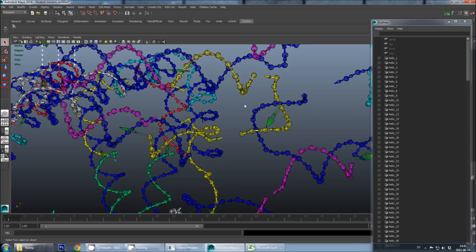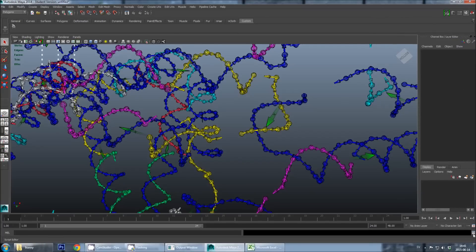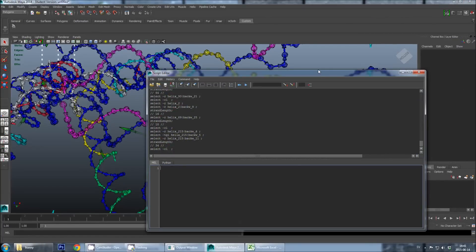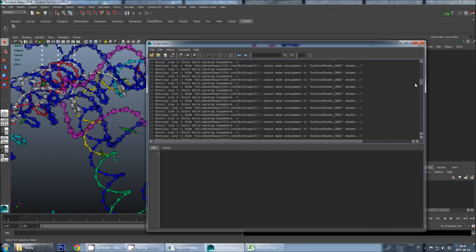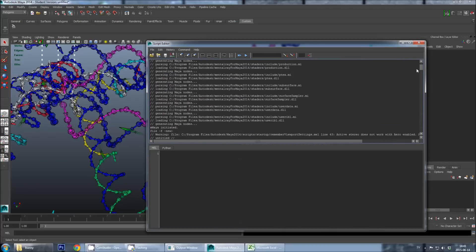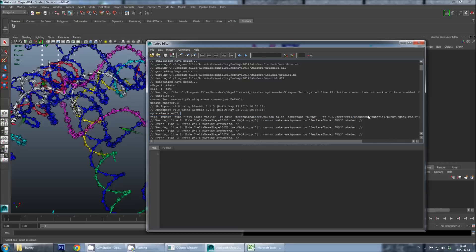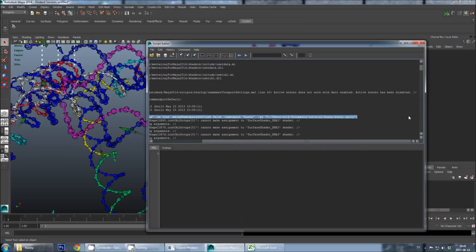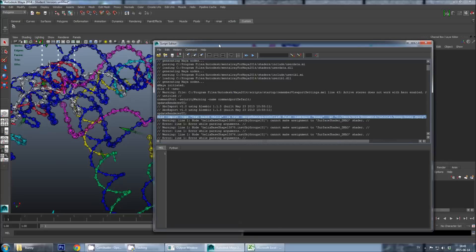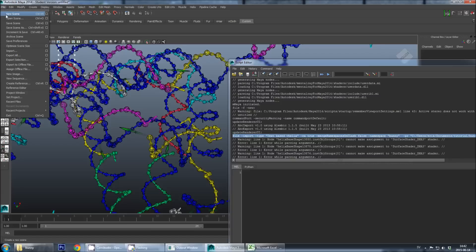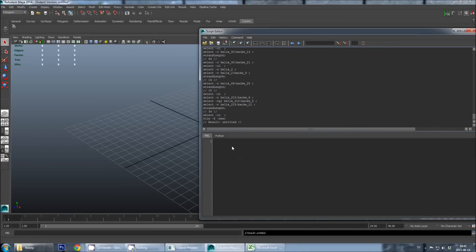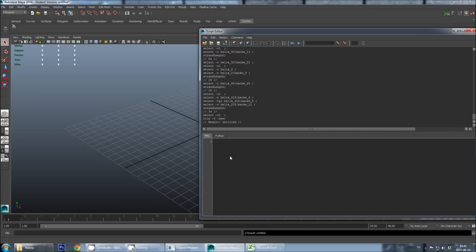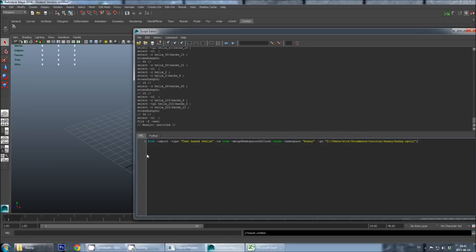And this is done by going in again to the script editor, and here is the history of output. And I will go to the very top, which is when we first hit import in this session to import the bunny mesh, and this is the most simple way to do this. And here I find this line called File Import TextBase V-Helix, which is actually what happened when I used the import menu in Maya. And I will just copy this line. And then I will, clicking in here, I will create a new scene.